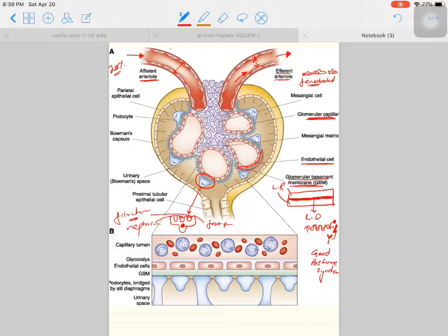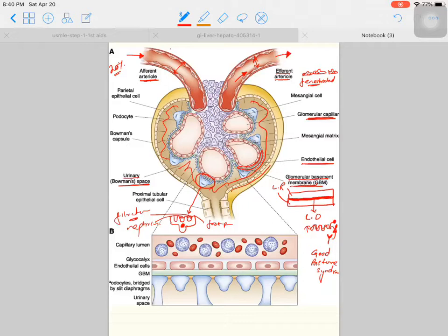After the podocytes we enter into the Bowman's capsule. This is the Bowman's capsule with a urinary space, also called the Bowman's space or capsular space. There is a parietal layer of squamous cells called the parietal epithelial cells, which form the capsular wall.